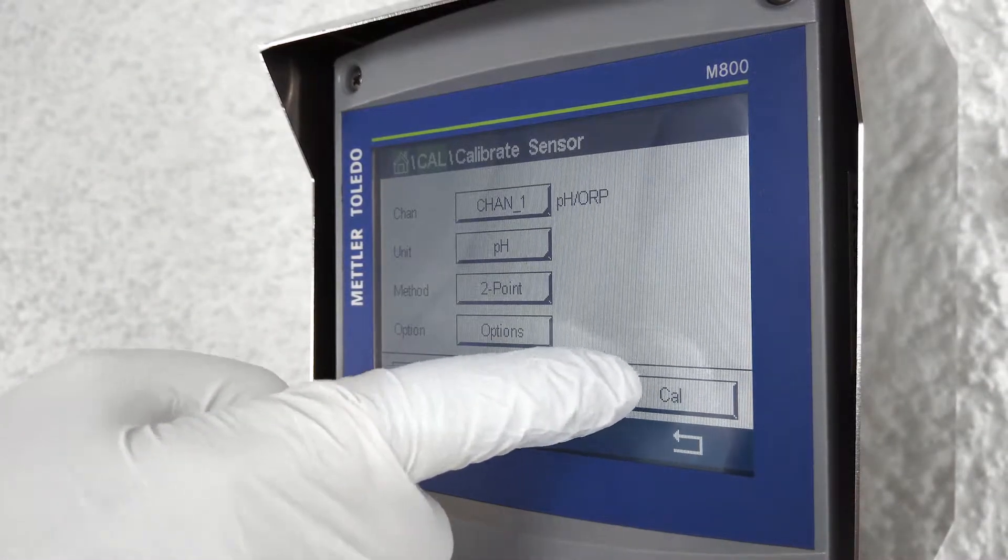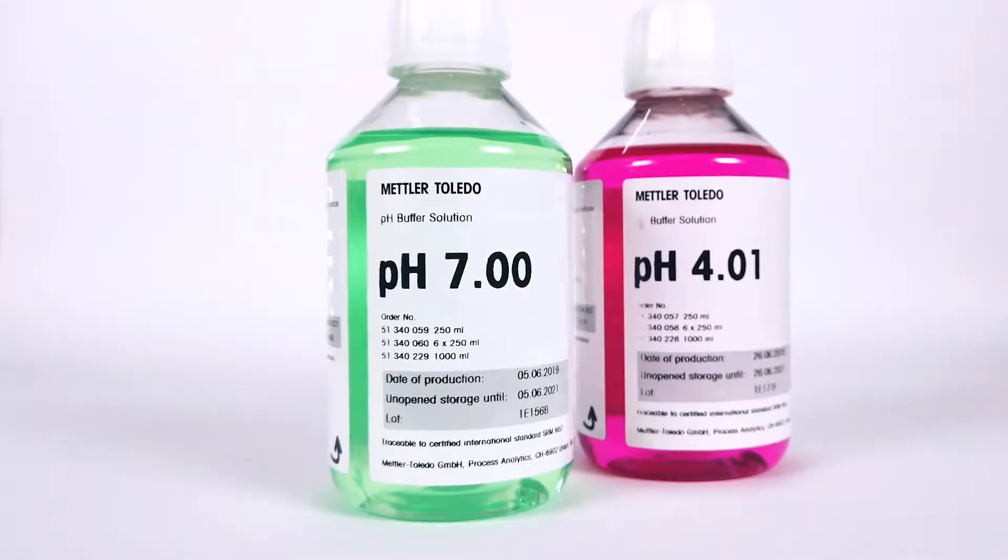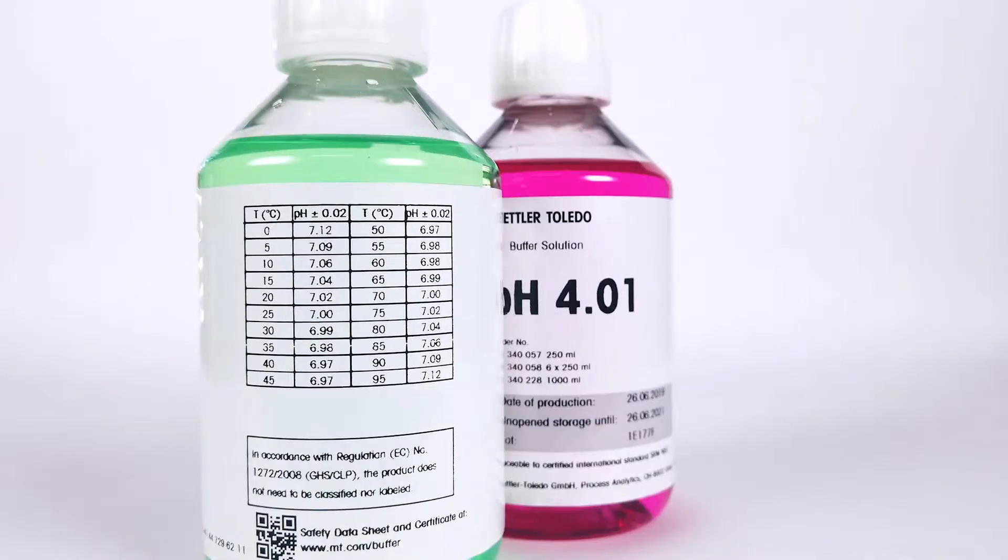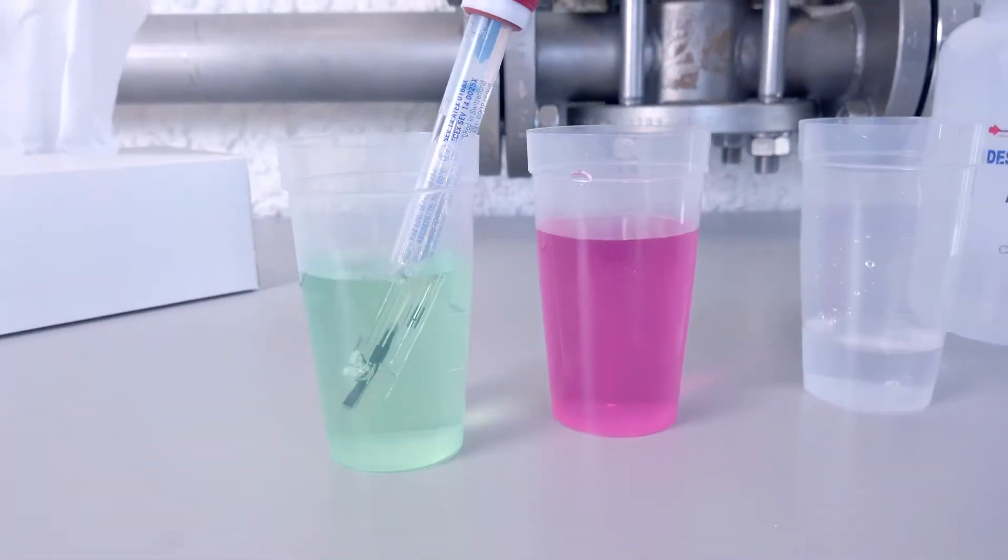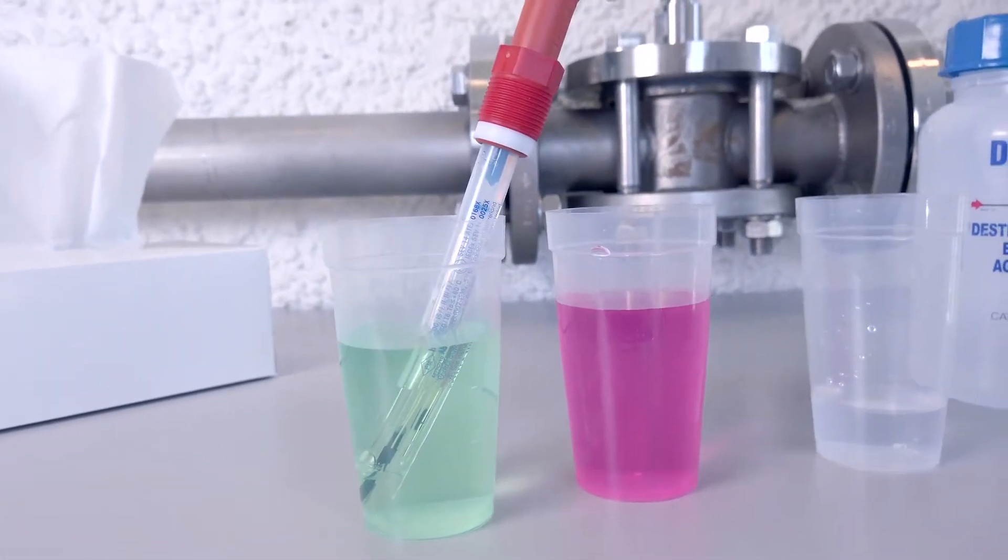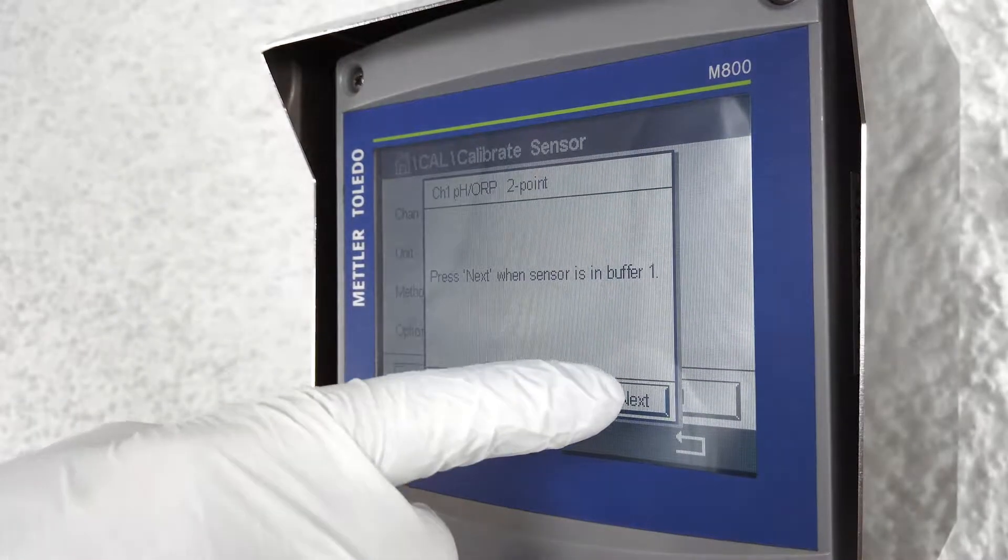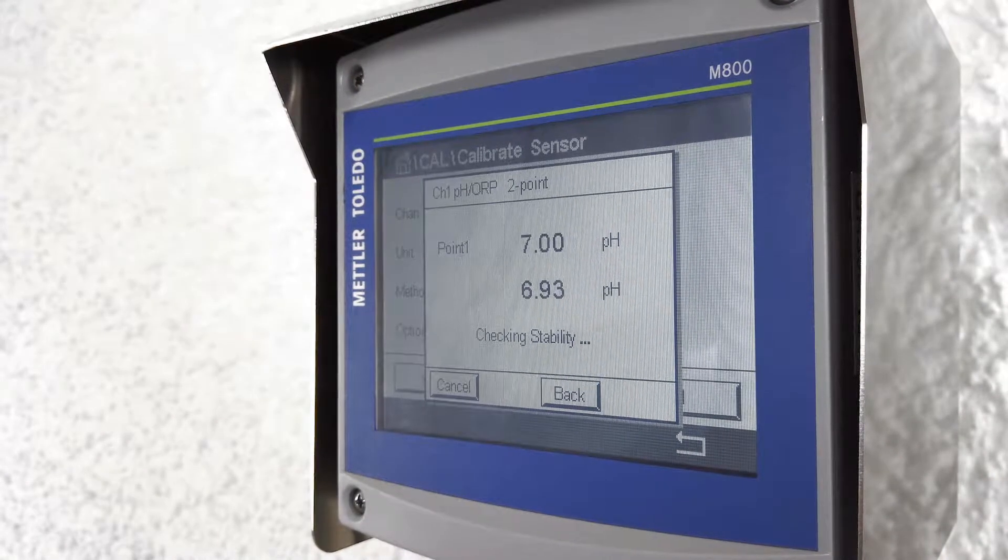The transmitter display indicates that the sensor should be put in the first buffer. Mettler Toledo transmitters can automatically detect buffers with a preset buffer table. You can either go to pH 7 or pH 4 first - the transmitter will automatically detect which one it is. In this case we're using pH 7 buffer first. Press next and you will see it's detected pH 7 buffer and it's calibrating the first point.